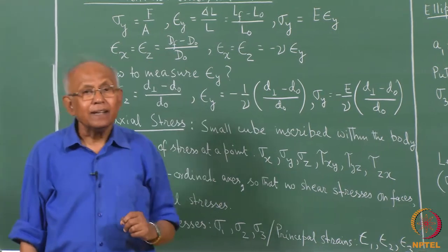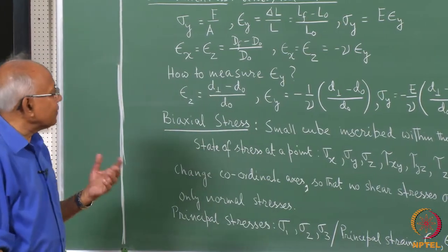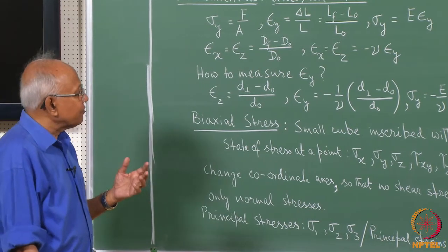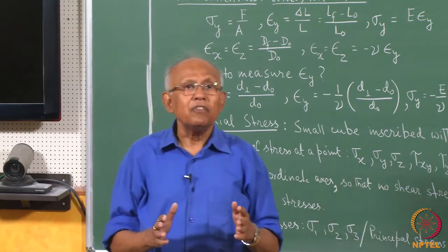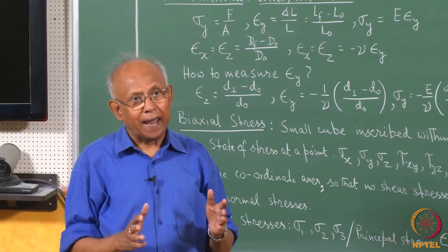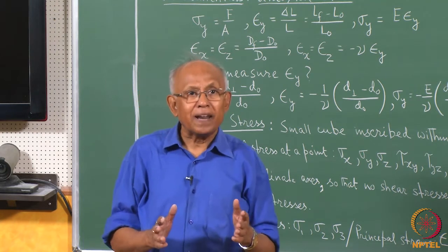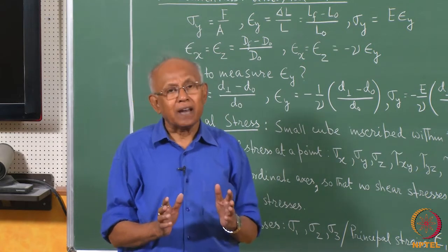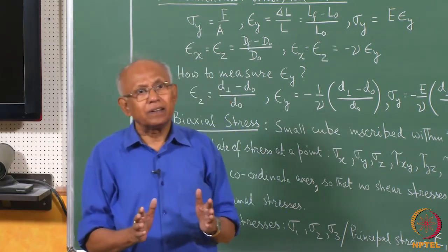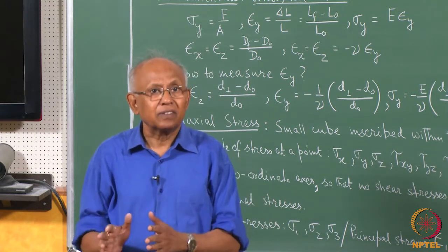So, you see that X-rays provide an elegant method of stress analysis by finding out the interplanar distance of a set of atomic planes in a particular grain which is properly arranged within the material, so that we can find out the value of the interplanar distance in the stressed condition and also in the unstressed condition.